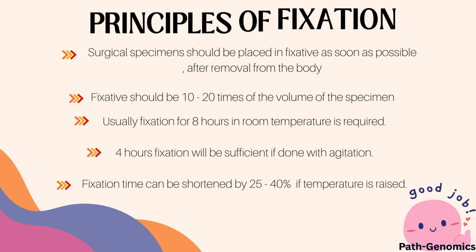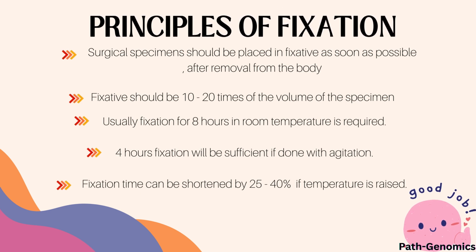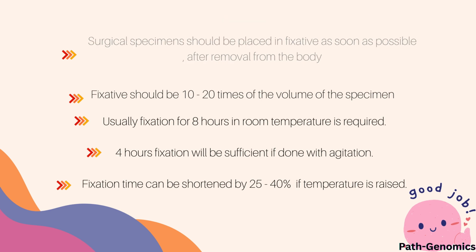There are some common principles in the process of fixation. After removal from the body, surgical specimens should be placed in fixative as soon as possible. Fixative should be 10 to 20 times the volume of the specimen. Usually fixation for 8 hours at room temperature is required. 4 hours fixation will be sufficient if done with agitation. Fixation time can be shortened by 25 to 40% if temperature is raised. This makes us understand that there are factors which affect the rate of fixation.